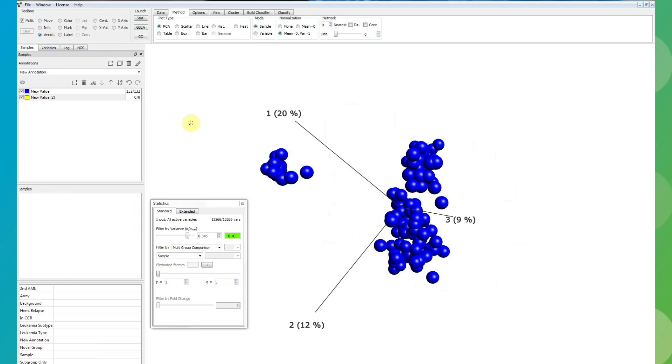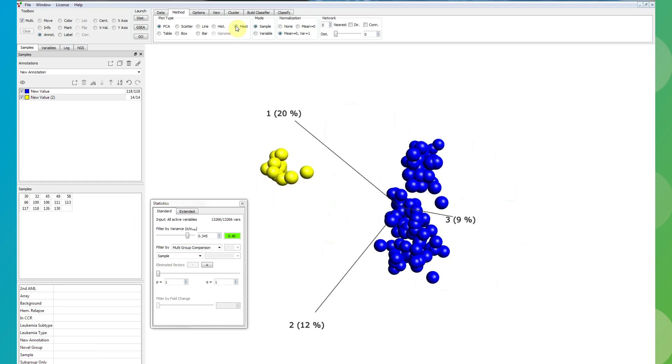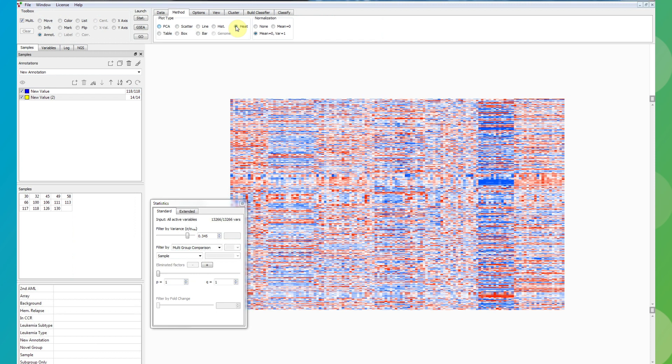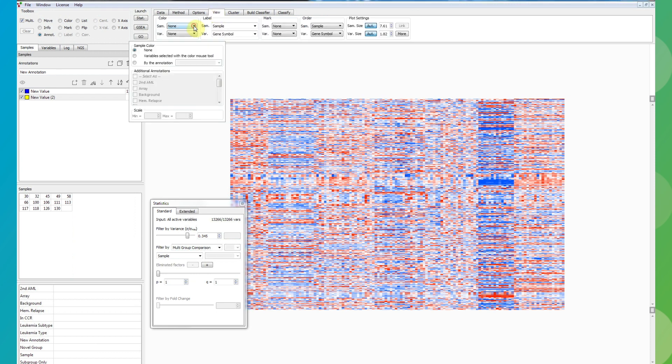Save the new groups using the annotate tool. For further investigation of the genes responsible for the grouping of the samples, you can easily switch to a heatmap and cluster on the variable side.